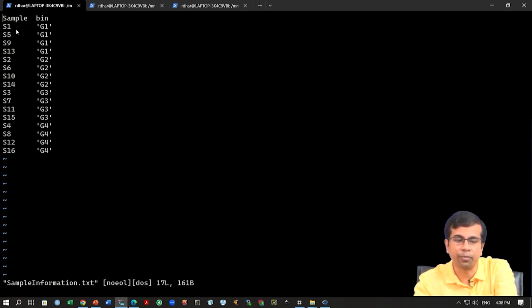So, S1, S5, S9, S13, the first 4 samples, belong to group 1. Okay. So, this is mentioned here. The next 4, S2, S6, S10, S14, belong to group 2. Then we have S3, S7, S11, S15, which belong to group 3, and the last 4, S4, S8, S12 and S16, belong to group 4. Okay. So, this bin actually gives the information about the experimental design. And we will use this information when we go for differential expression analysis.